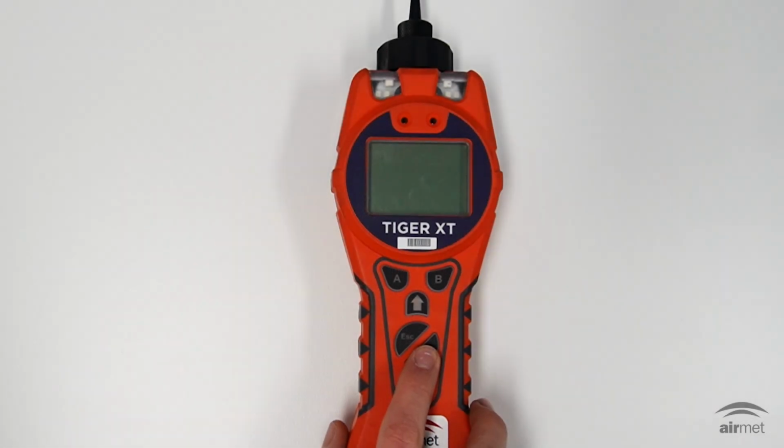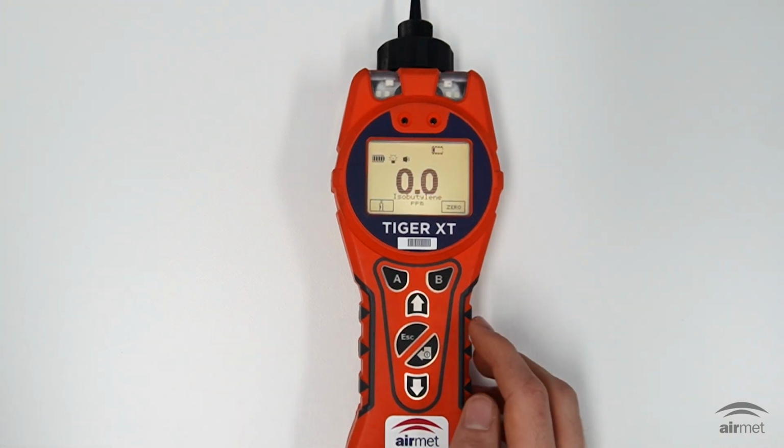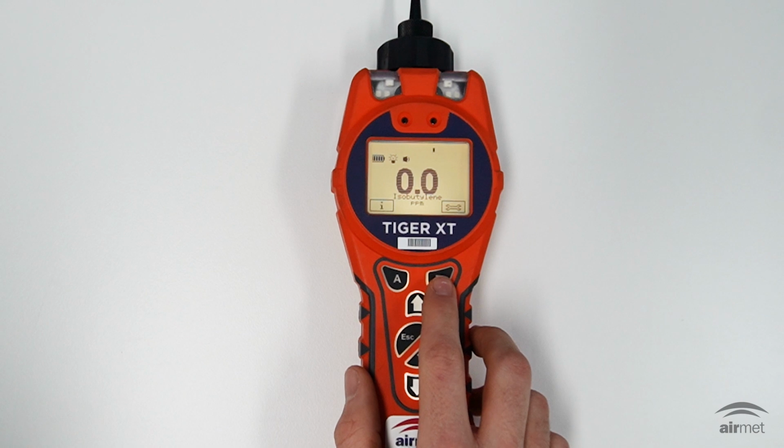To change the unit of measure in the field, first turn on your Tiger XT PID. Use the directional buttons to cycle through the functions until you see the settings icon, and then press the soft key to enter.